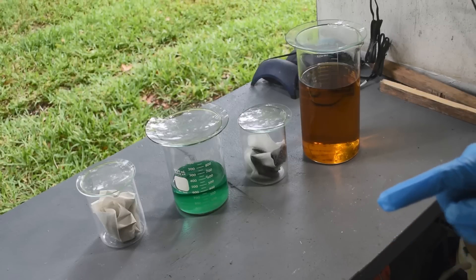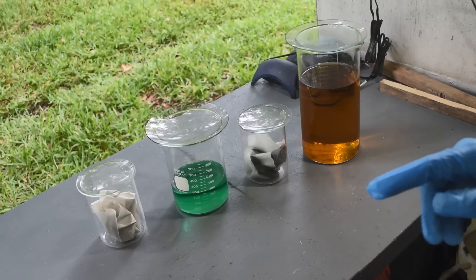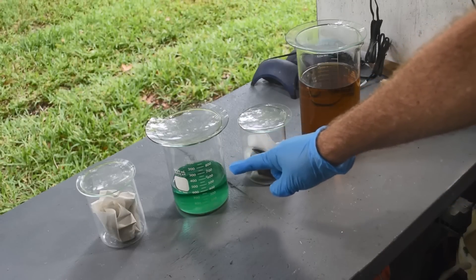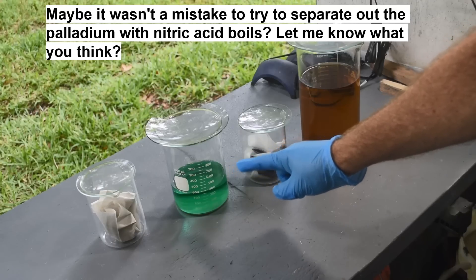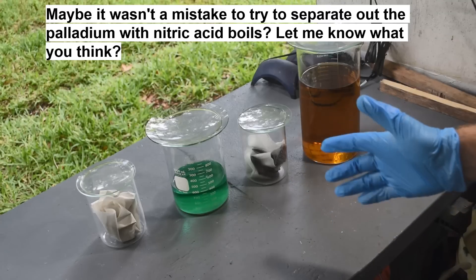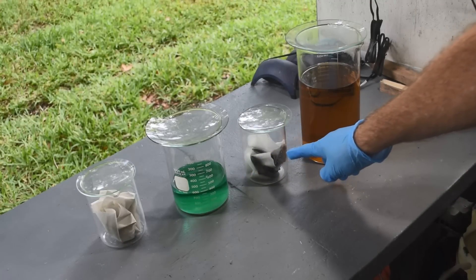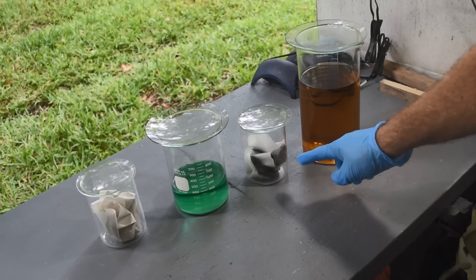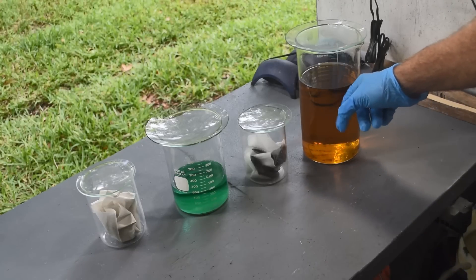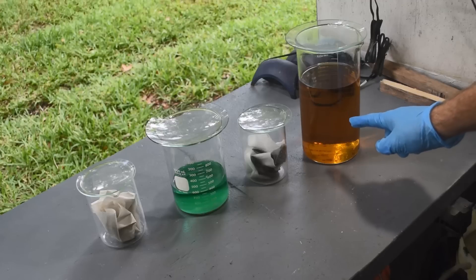In part two we started treating the material with various chemicals to separate out the precious metals. I made a few beginner mistakes and wound up with a beaker full of liquid showing a very strong indication for palladium on a stannous chloride test. From the bulk of the material I also managed to precipitate something that looks an awful lot like gold caught on these filters, and the remaining material gives a very strong indication for palladium and possibly platinum.